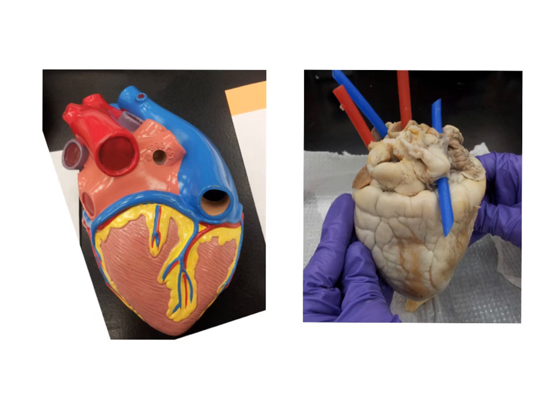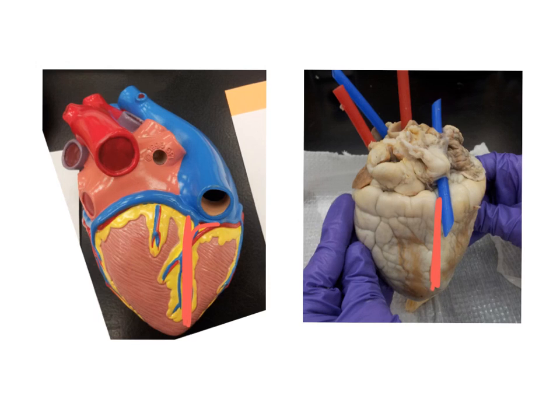Here's a look at the posterior or the dorsal surface of the heart. Here you can see that the coronary artery is not going at an angle but more straight up and down, so you can really tell the difference from the anterior and the posterior. This branch is the posterior interventricular branch of the right coronary artery. So again: anterior, ventral, posterior, dorsal.